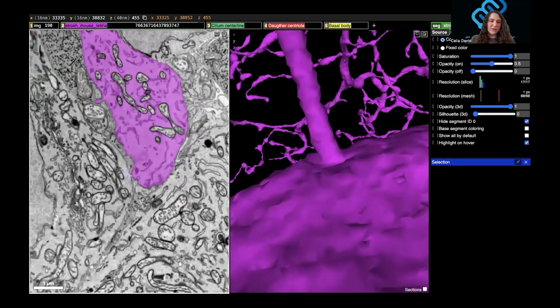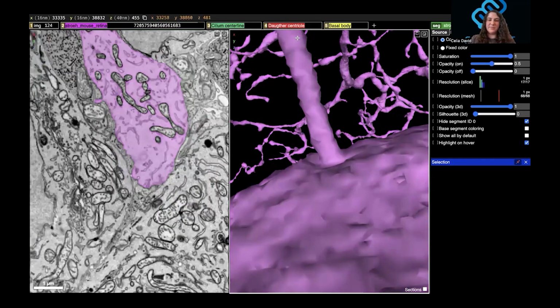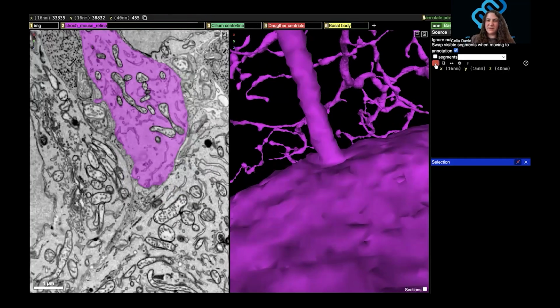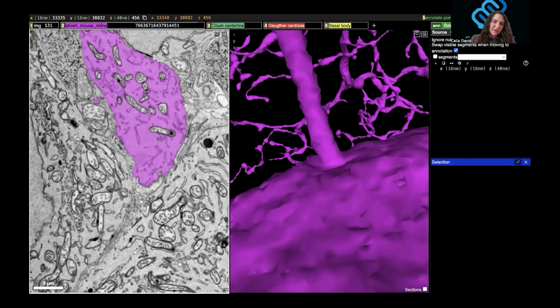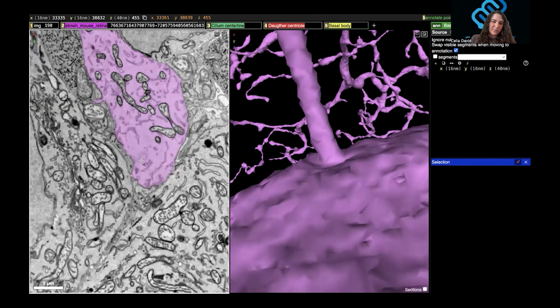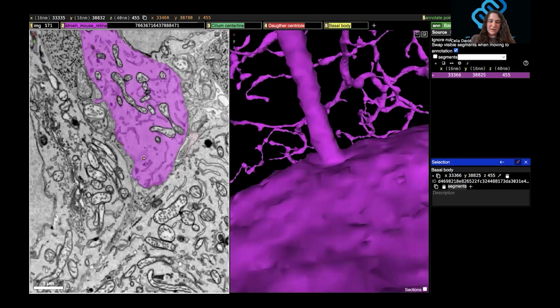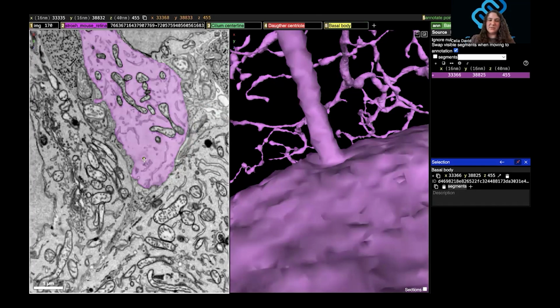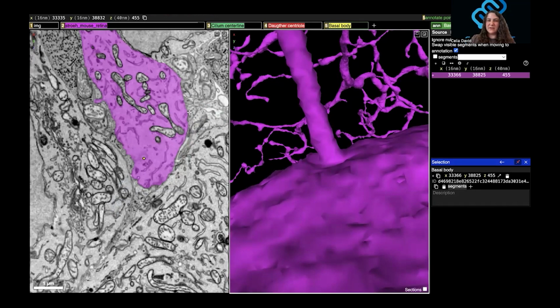So the way that you're going to label these is I usually start with one of these. You're going to use an annotation point. You have to click to activate it. Okay, so I'm in the basal body right now. So I'm going to put an annotation point on that by control and click. And you can see that the color of the annotation point is the same as the layer. So to make sure you're in the right layer, just check that you're putting down the right color annotation point.